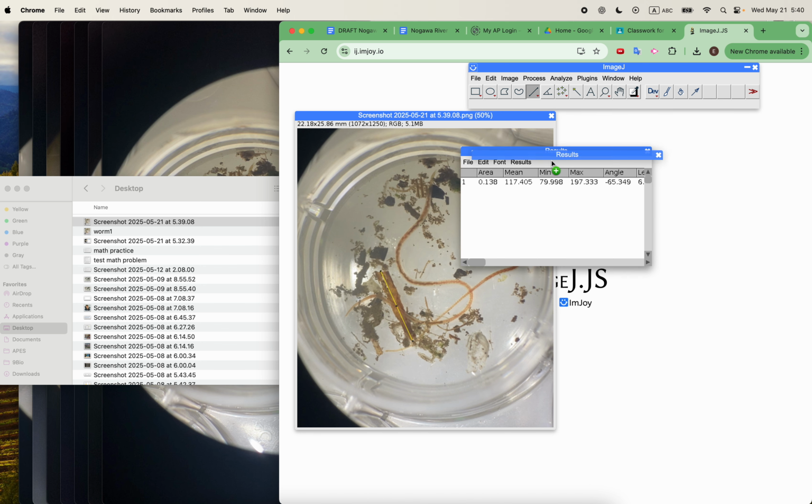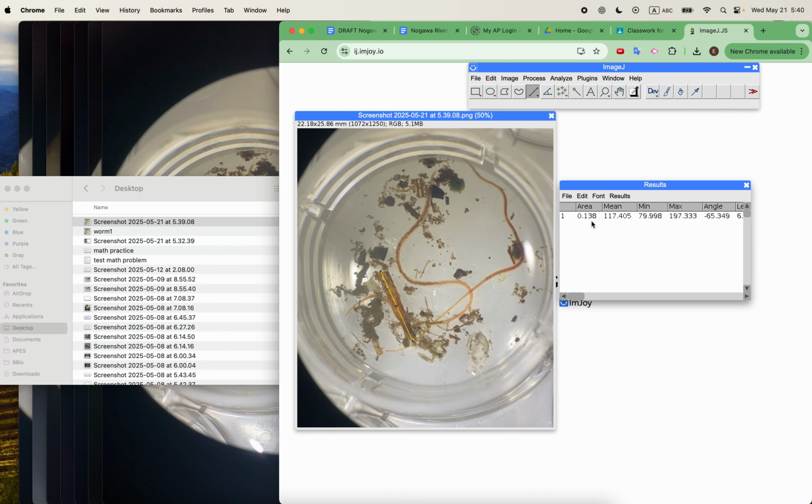And so now I have this box. I'm not measuring an area, but it should give me over here a length. And if you think about it, if the diameter was 20, it would make sense that this little thing is about 6.6. And again, this is millimeters.